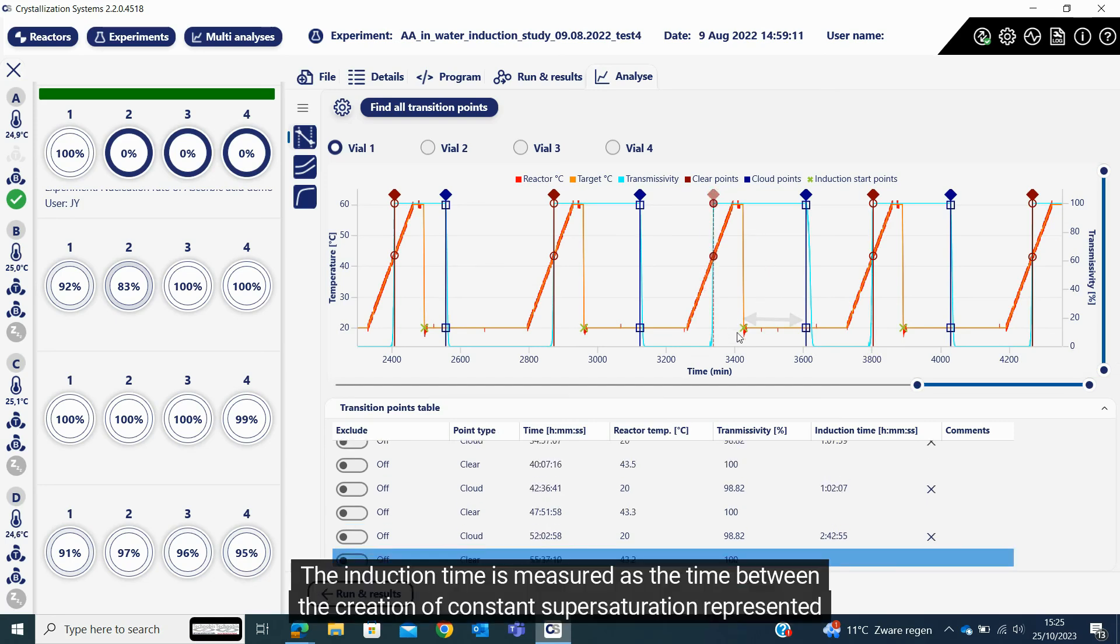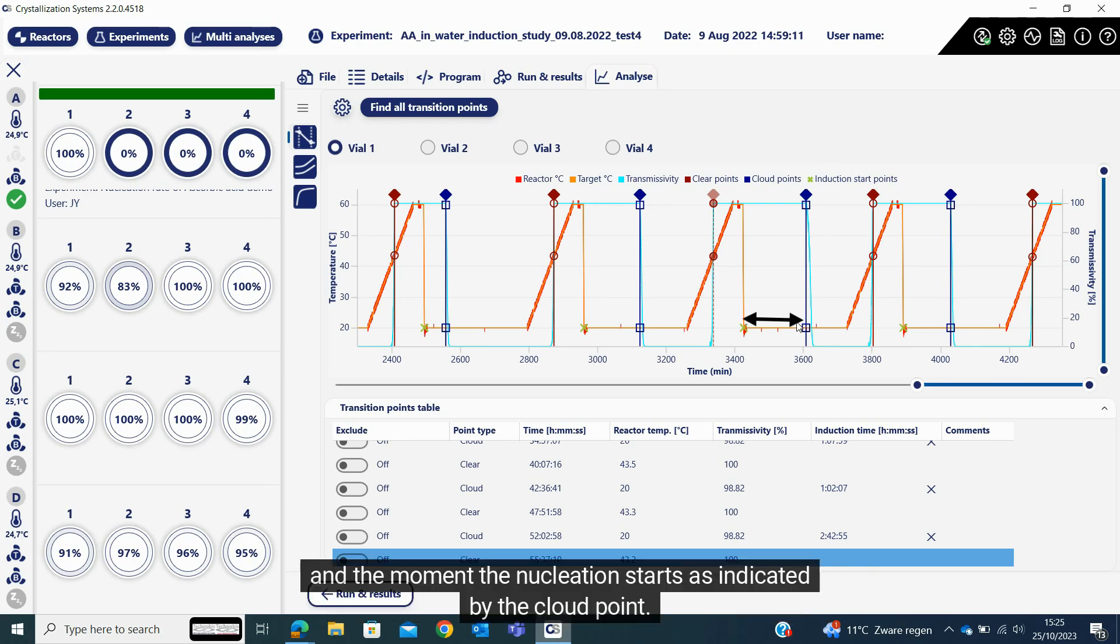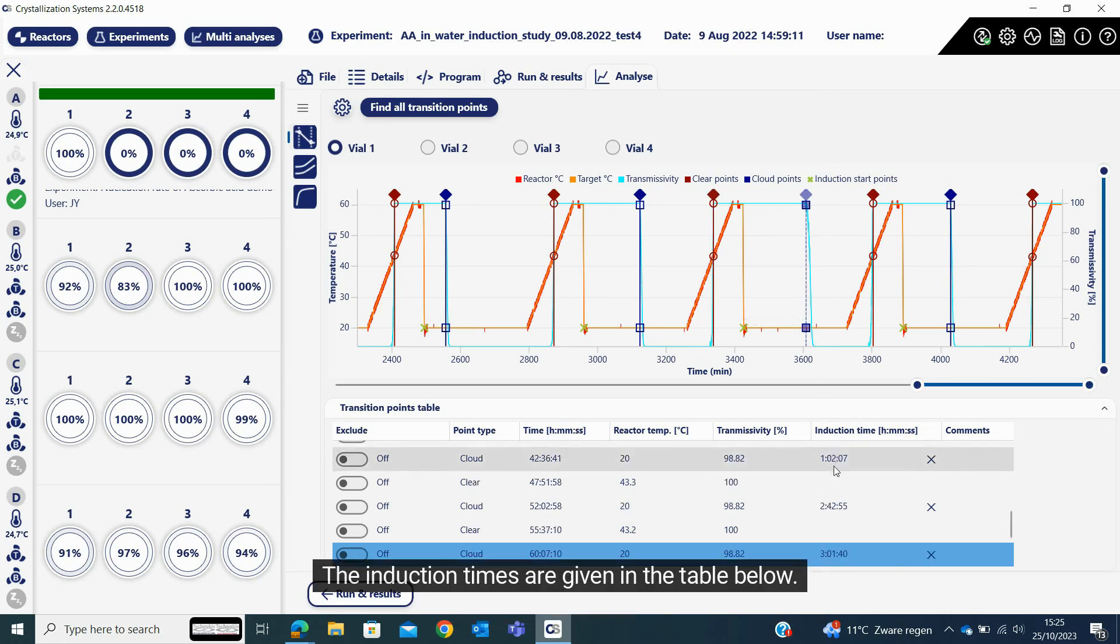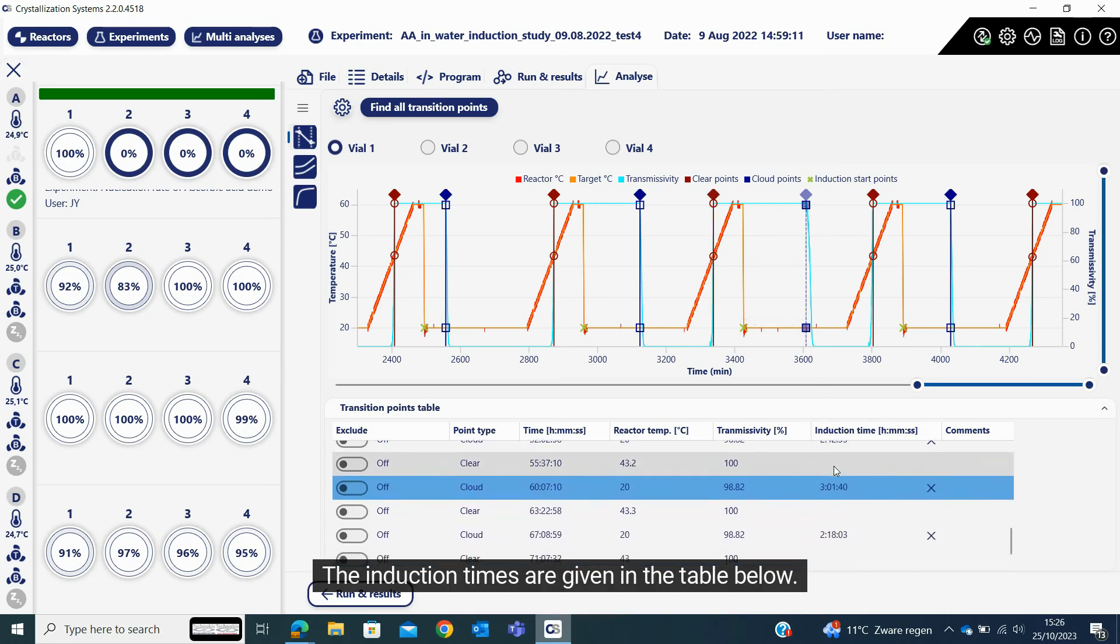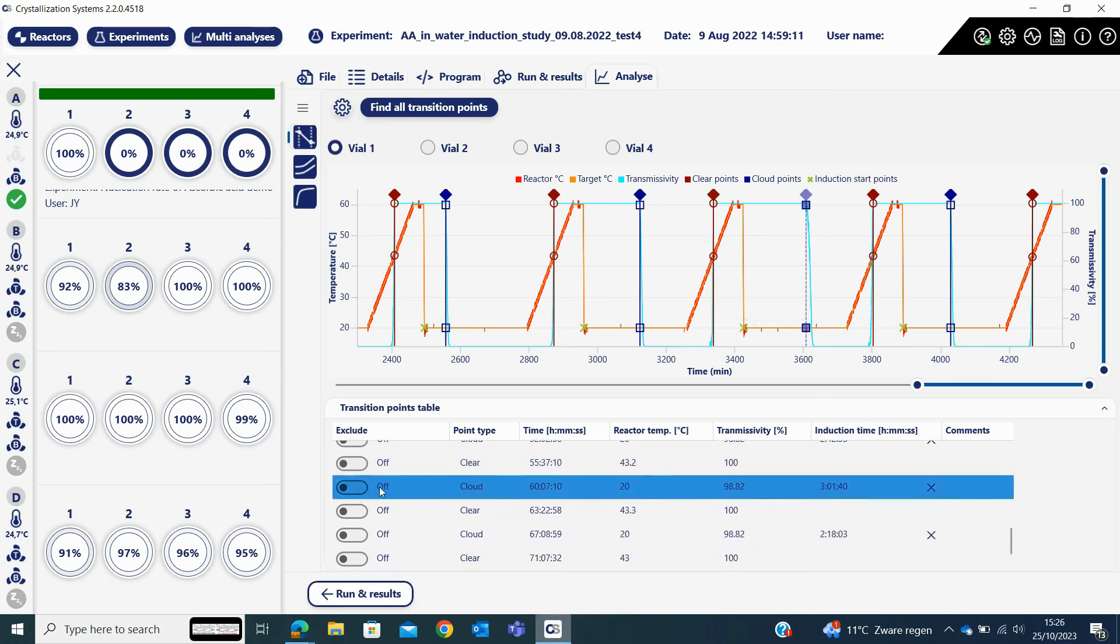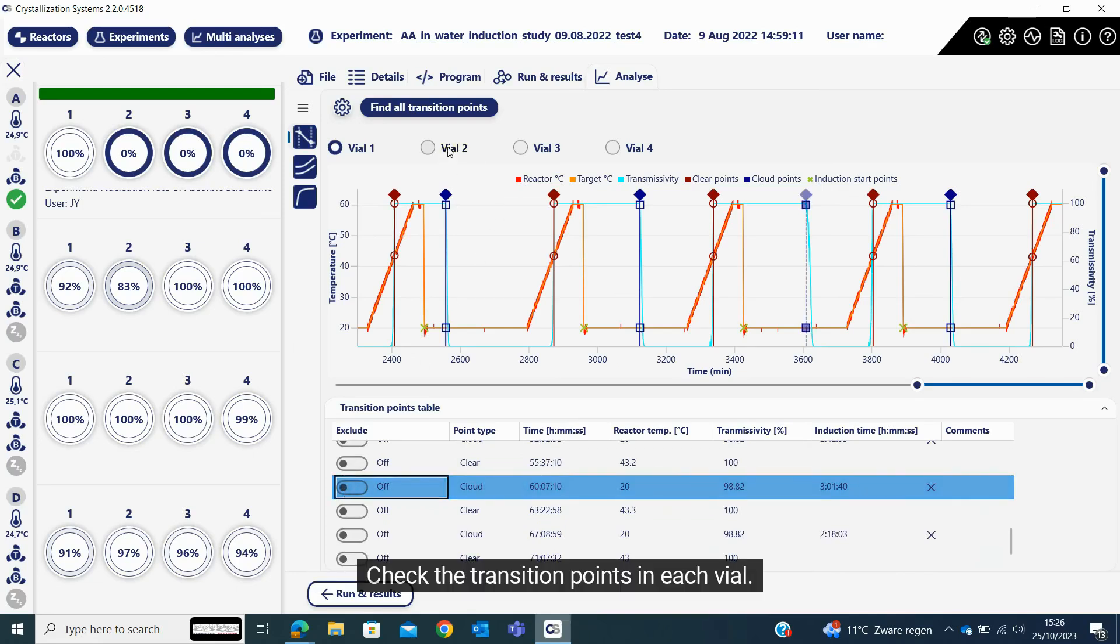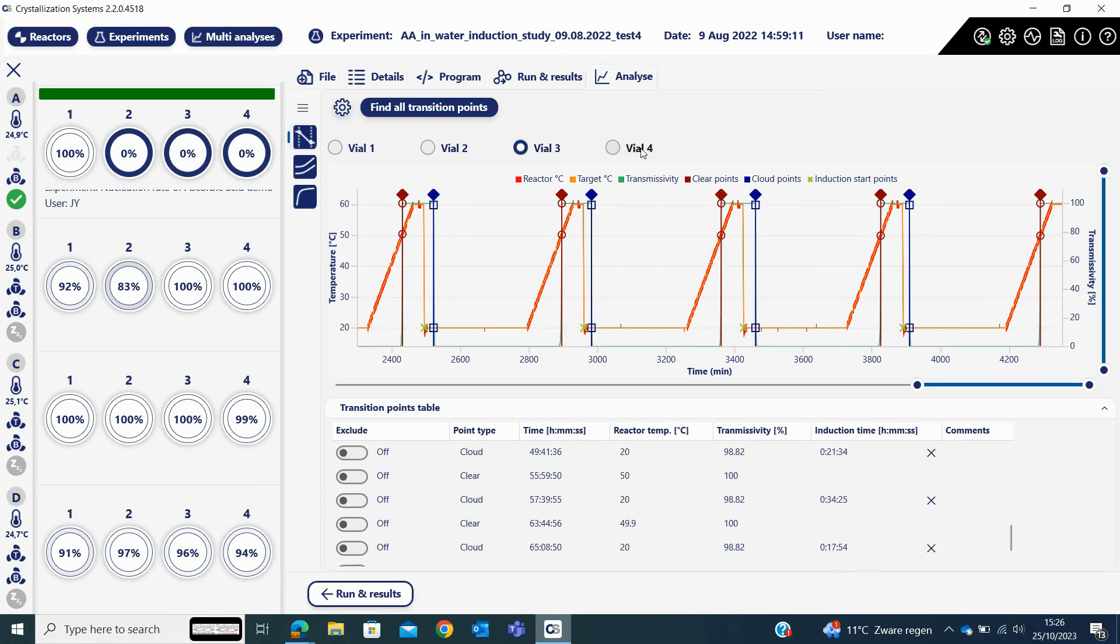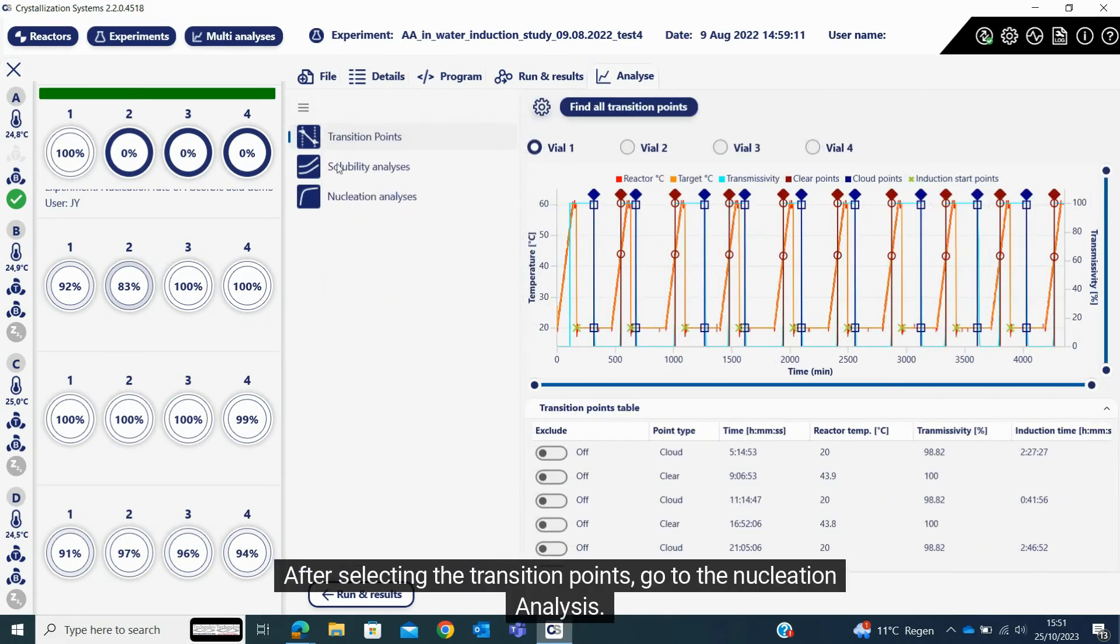The induction time is measured as the time between the creation of constant supersaturation represented as a green cross sign and the moment the nucleation starts as indicated by the cloud point. The induction times are given in the table below. Select or deselect the transition points from the table. Check the transition points in each vial.